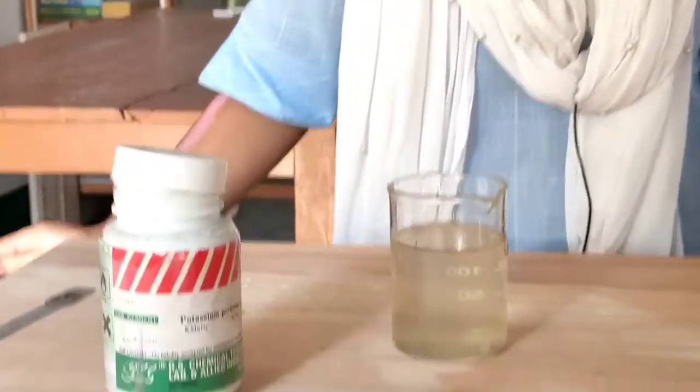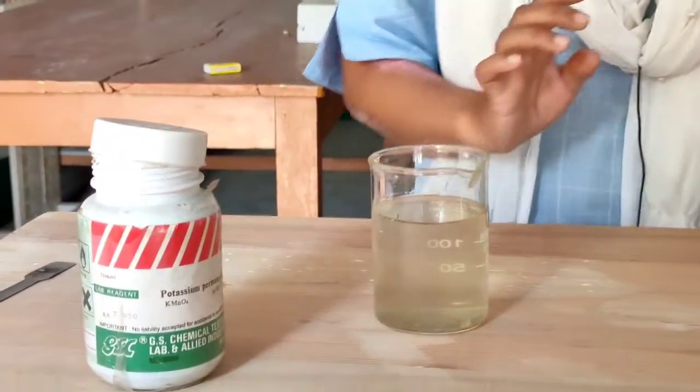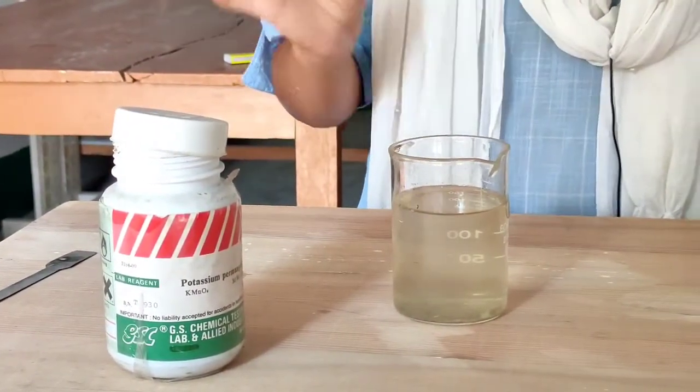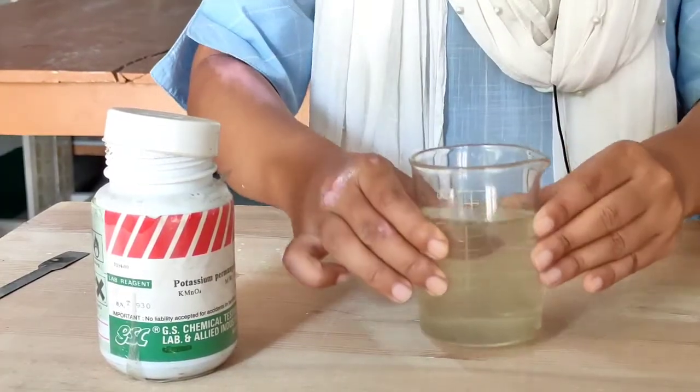What is diffusion? If we go through the simple meaning of diffusion, diffusion means movement of water or any particles from a higher concentration towards the lower concentration. So here in diffusion you do not need any semi-permeable membrane. Diffusion can occur in any state of matter, that is liquid, solid or gas. So here is a beaker of water.